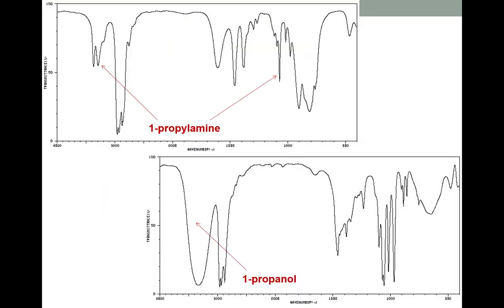And so we can see that if we look at simple alcohols and amines. Here's propanol at the bottom, a 3-carbon alcohol, and we see that gigantic broad peak in that 3300, 3400, 3500 wave number kind of range. In propylamine, we see a couple of things. We see the CN bond down here that I didn't even mention because it's in the fingerprint region, but we see the NH bonds here. Propylamine has a terminal nitrogen, so we have two NH bonds, and I'm seeing both of those, which is kind of a neat thing. That's pretty typical of an NH2 group somewhere in your molecule.